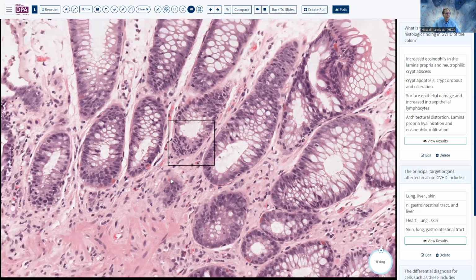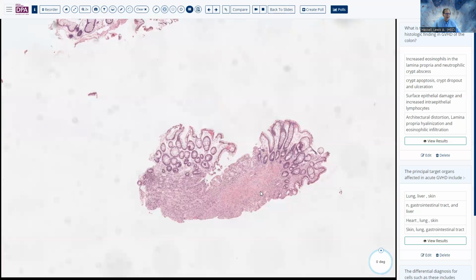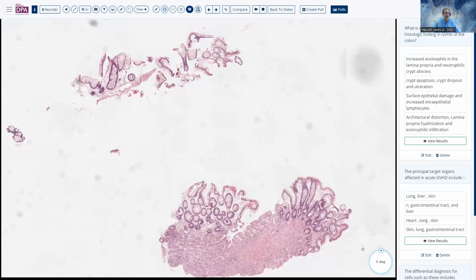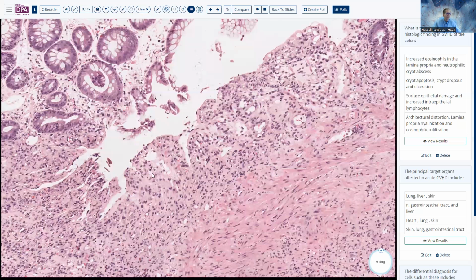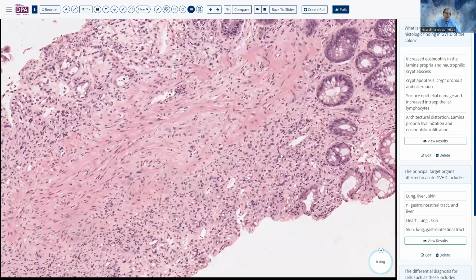Now, going back to low magnification, this is not a disorder you can make the diagnosis of at low magnification. So the clues here are otherwise normal looking mucosa with maybe depletion of the lymphocyte component in the lamina propria. But if you find graft versus host disease, you shouldn't just stop there, because that doesn't necessarily cause this ulcer. And so you want to begin to be looking for other possibilities.